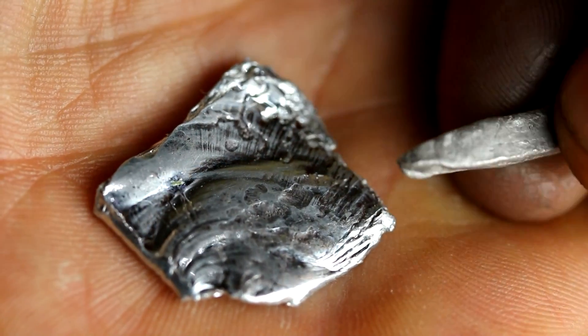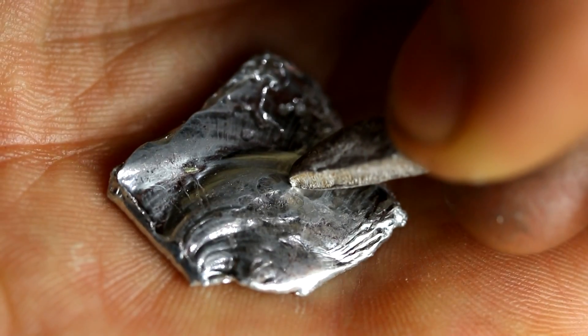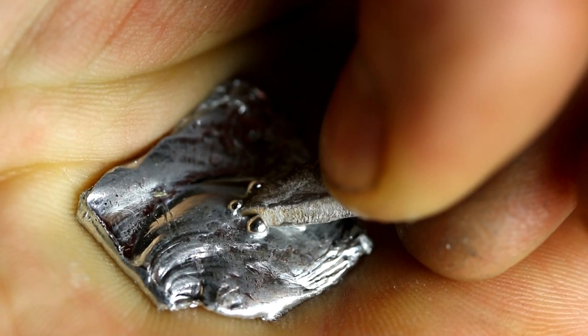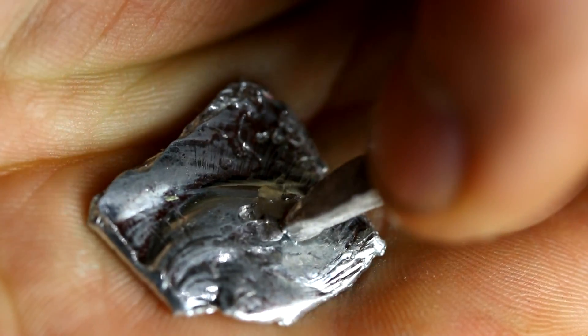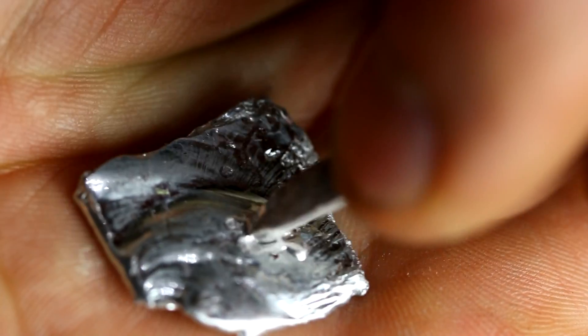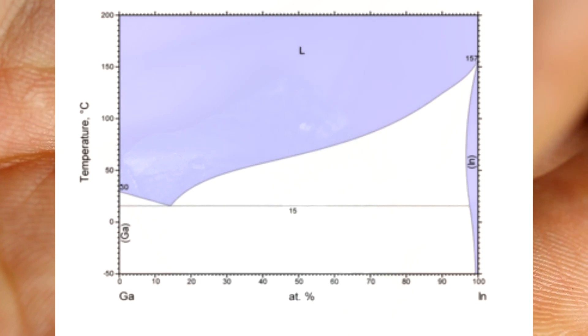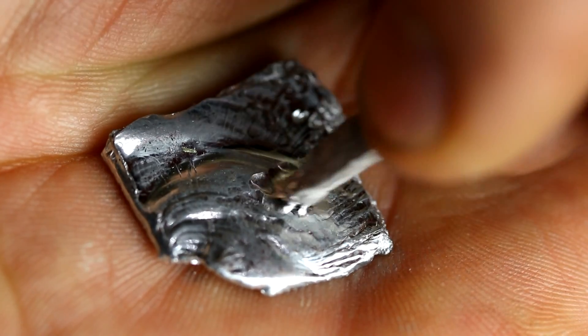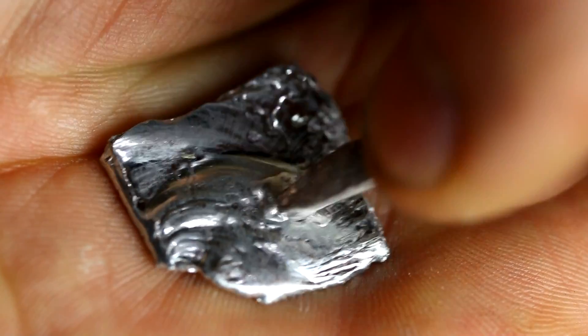If I take these two metals, which are solid, and I combine them, look what happens. A liquid is formed. In fact, these two materials when they're combined they form a eutectic alloy which melts at 15 degrees centigrade, which is liquid in my hand.